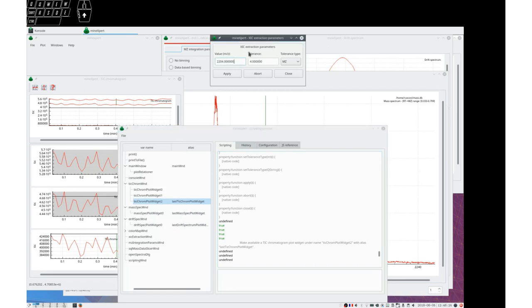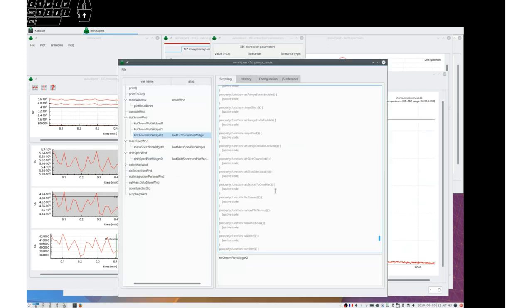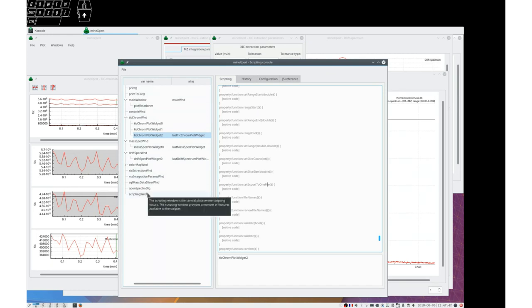So I know I have produced that Zick chromatogram. So this is for the Zick extraction parameters. So this is the way the objects that are produced during the operation of the program are generated.